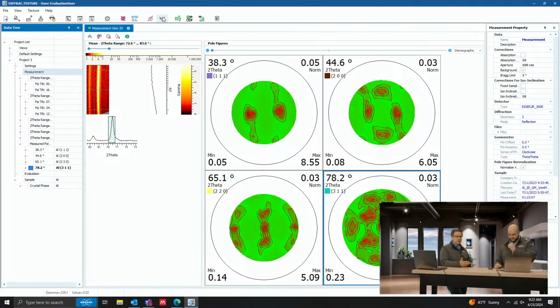Yeah, so it's measuring the pole figures using mathematical models, and then you extract the orientation of those math models, and that's how you would build it up. Exactly. Whereas, like you said, the component method is a newer method. Yeah, it's kind of like a Rietveld refinement almost. Yeah, where you're actually doing real modeling. You're saying, I got this much of this, the grains are pointing this way, and so many of the crystallites pointing that way. Exactly.